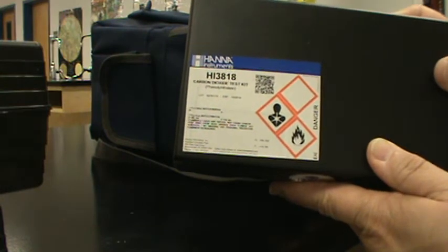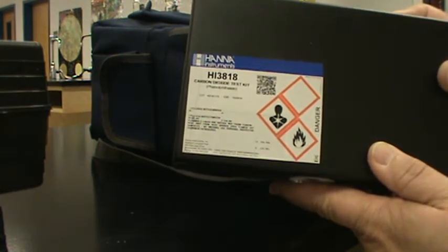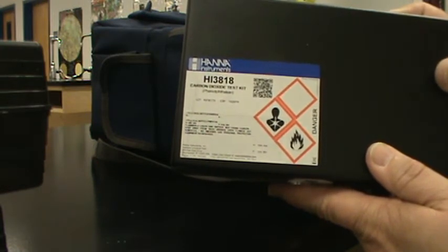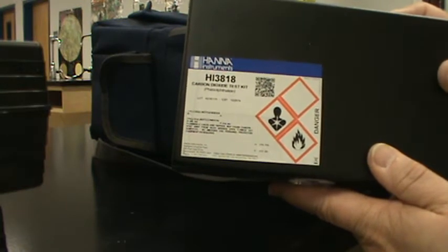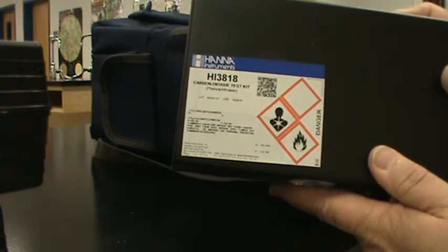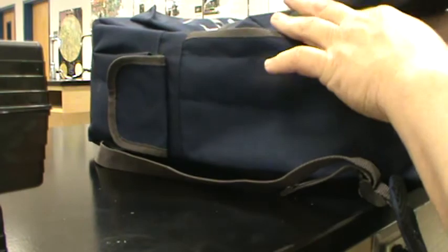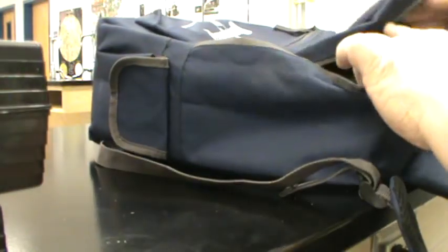Without oxygen, fish and other organisms that live in the water would not be able to survive. So the rule of thumb is the higher the oxygen level in the water, the better the water quality. Conversely, the higher the carbon dioxide level, the worse the water quality. So there's that. And we also have our handy-dandy pH tester.